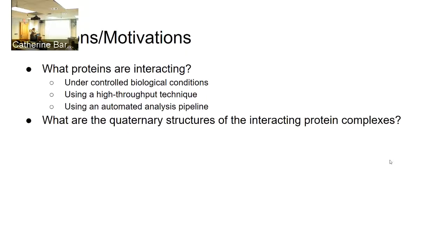This is also a question that I'm particularly interested in, and so I'll talk about it quite a bit at the end, which is the fact that cross-linking-based mass spectrometry data isn't just protein interaction data, it's actually low-resolution structural information as well, because these proteins have to be within a certain distance of each other in order for the cross-links to even physically cross-link. And so we can, in theory, use that to infer some of the quaternary structures of interacting proteins, regardless of whether or not we have a crystal structure of that.